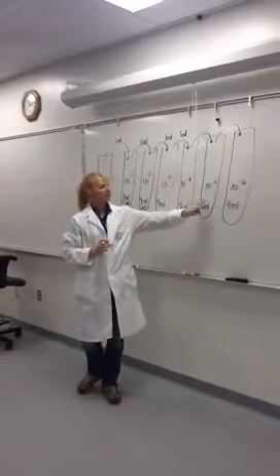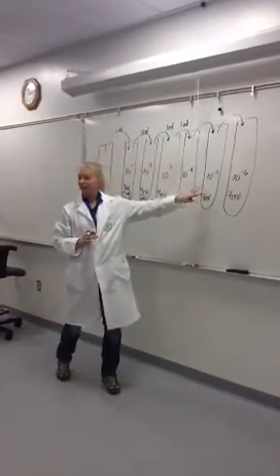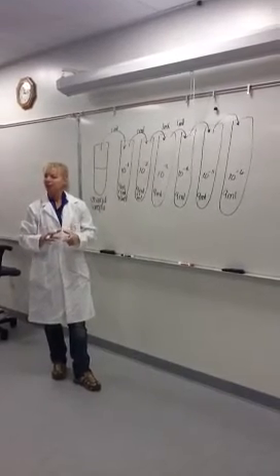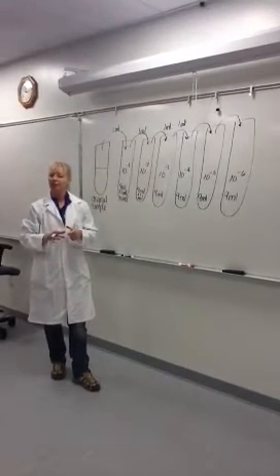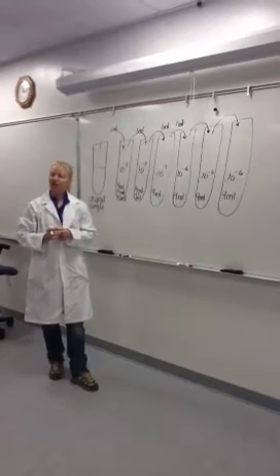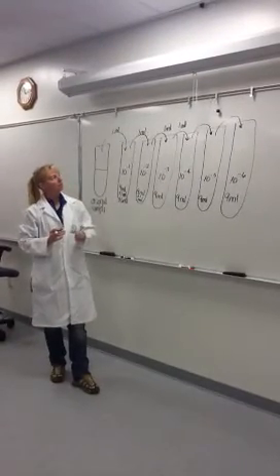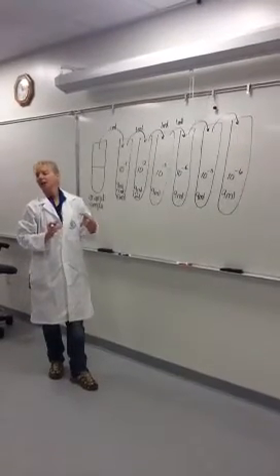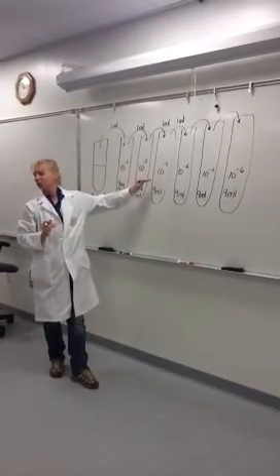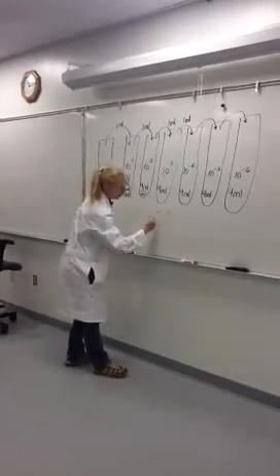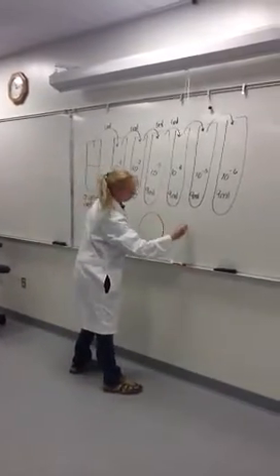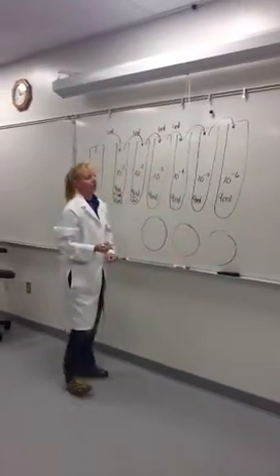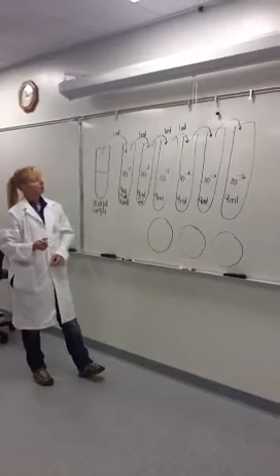This is usually still not diluted enough. And to put one milliliter on your typical size Petri plate is going to be too much fluid. So now what we're going to do is take one one hundredth of this and dilute it even more. So we would have our plates here. And we're only going to use the three most diluted ones.